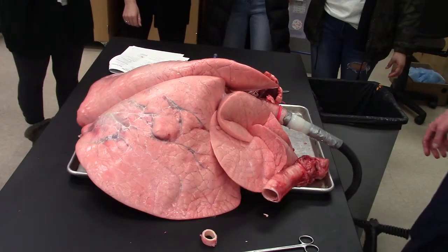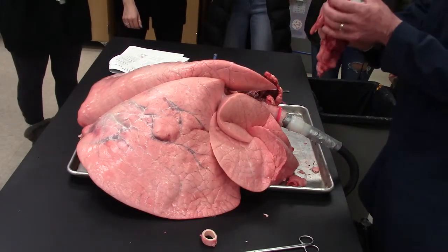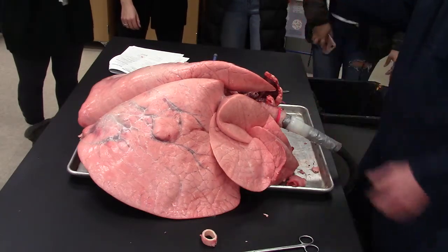While I have your attention, I took off a piece. There's the trachea and the C-shaped rings that you looked at last quarter when you did tissues. So that's the airway.